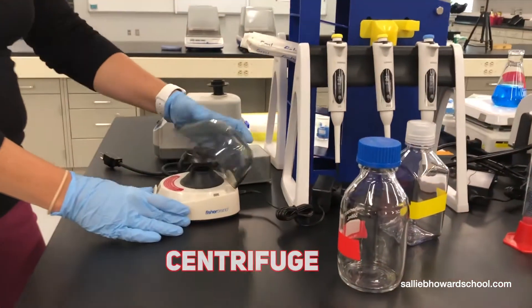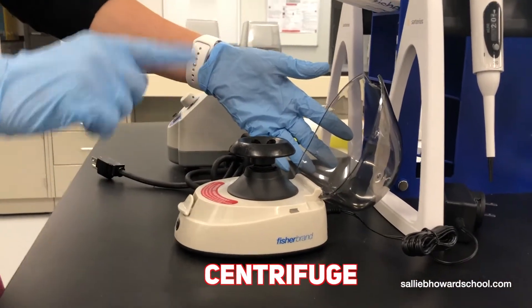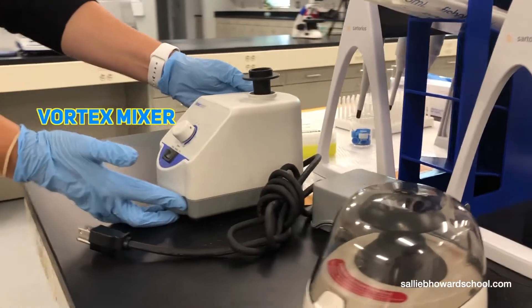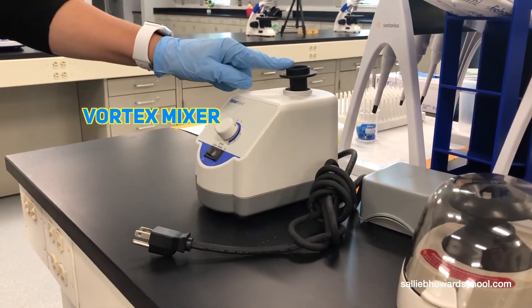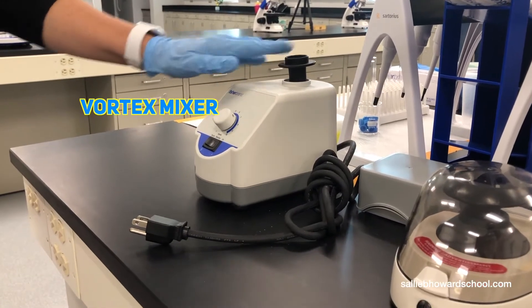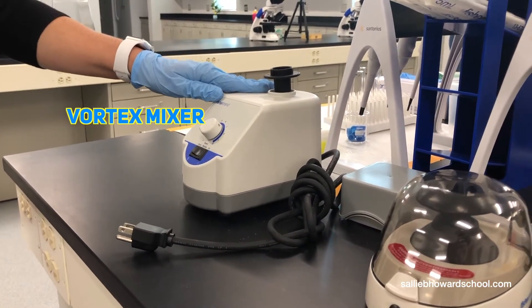This is a centrifuge, so we will put our tubes in here and students will be able to spin things down. This is our vortexer, and it's just a simple way to shake things up. It gives it a nice little spin in a certain direction, and it has different components for it — each lab table is outfitted with one of these as well.